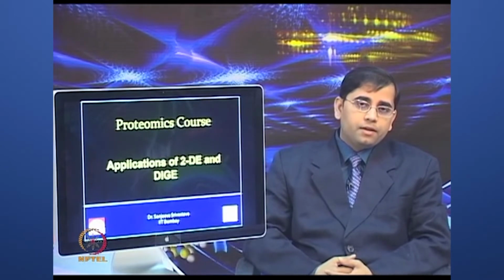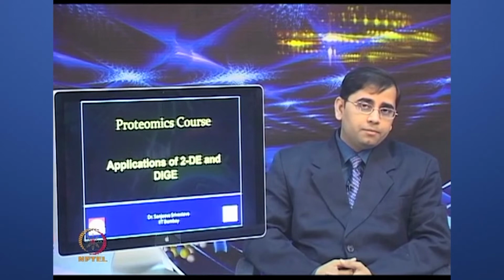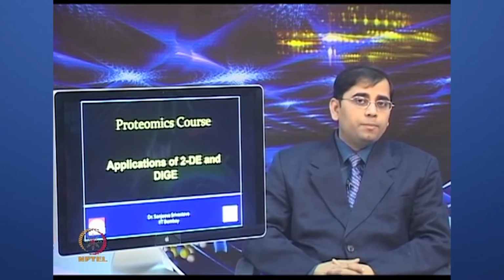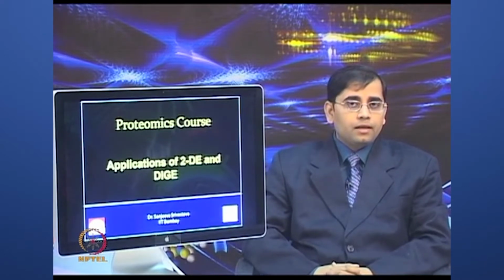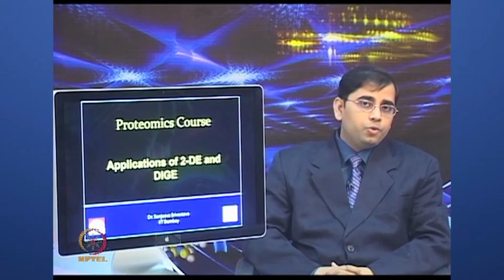the spots, and then scan those images, analyze them by using various software, and then perform some statistical analysis to obtain some biological insight. Now, this workflow remains the same regardless of whatever application one wants to use for different types of biological questions. I started discussing two-dimensional electrophoresis applications in the last class. I gave you an overview of the 2D at that time.